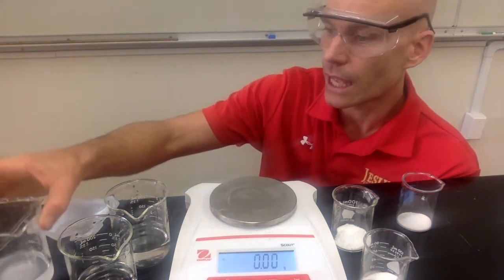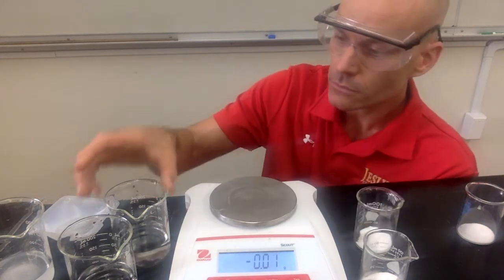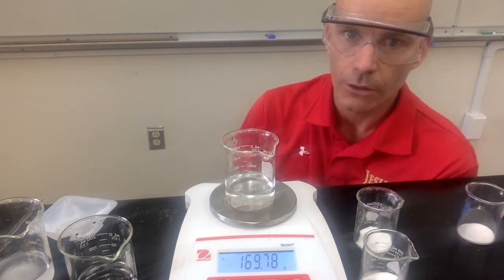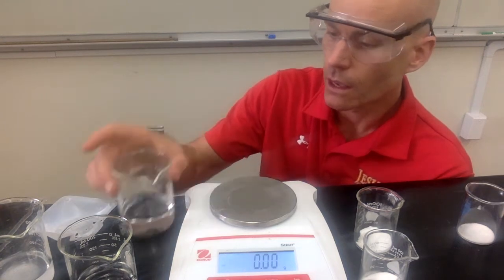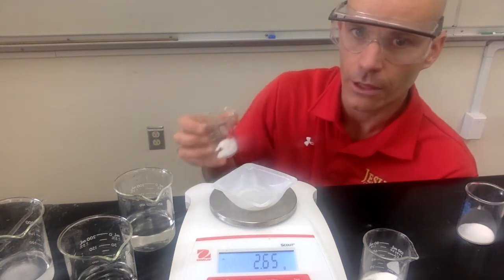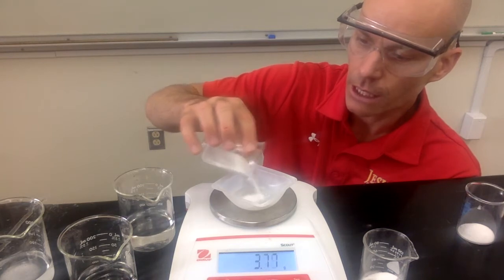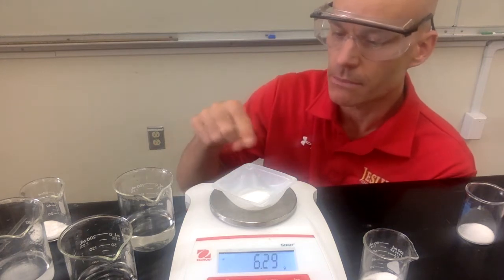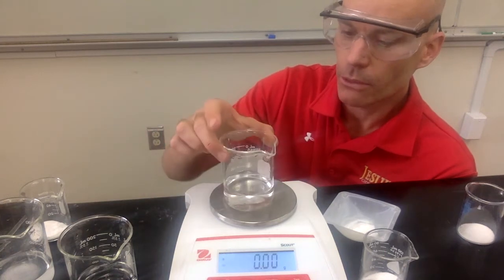All right, let's try that again with our next reactant. So our next reactant is the sodium bicarbonate. I have a new beaker of acetic acid, so record the mass of this beaker and this acetic acid. And then we need to get a sample of the sodium bicarbonate. So we've got the weighing dish when it's empty, and we'll add in the sodium bicarbonate. Okay, and so you can again subtract the mass of the empty weighing dish to get the mass of just the sodium bicarbonate that's in this sample. And now I'll put that back on here.